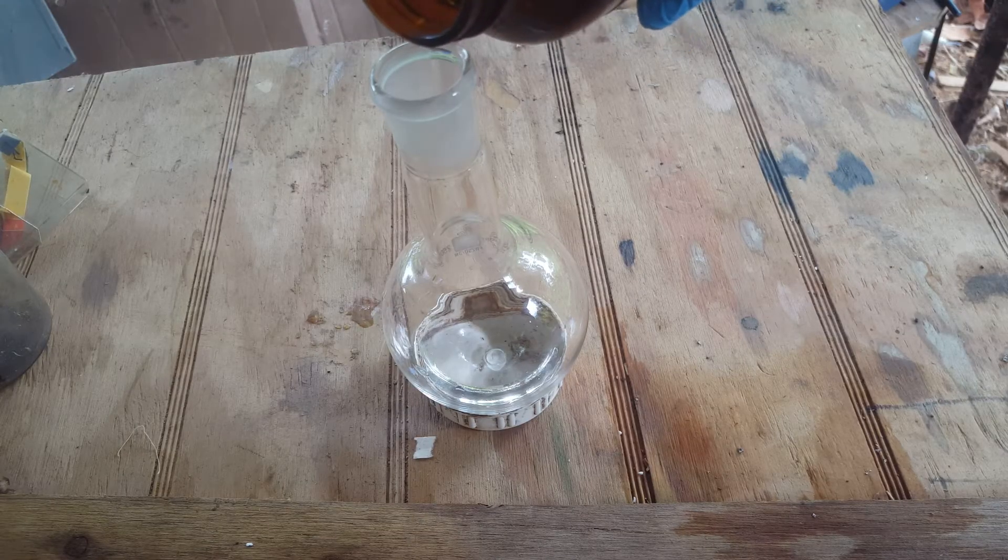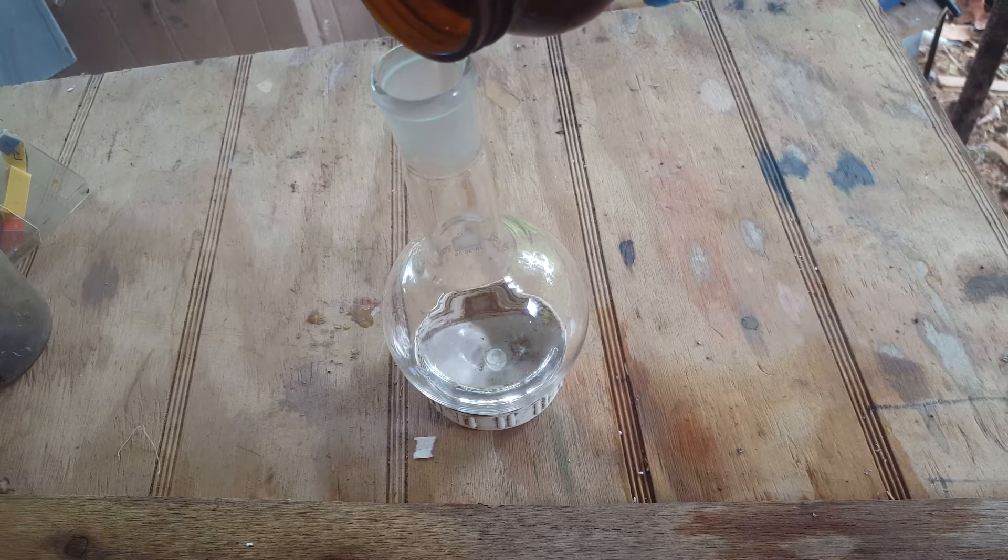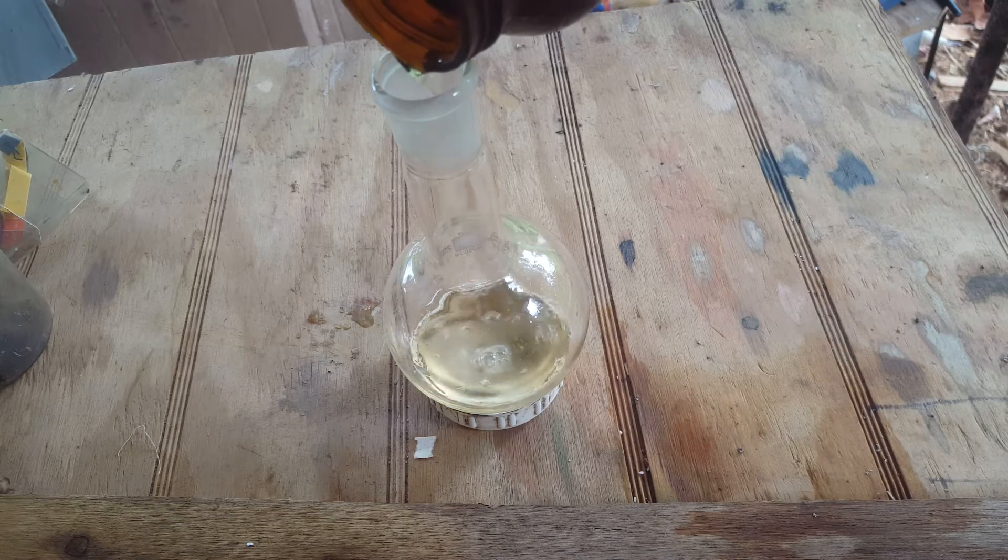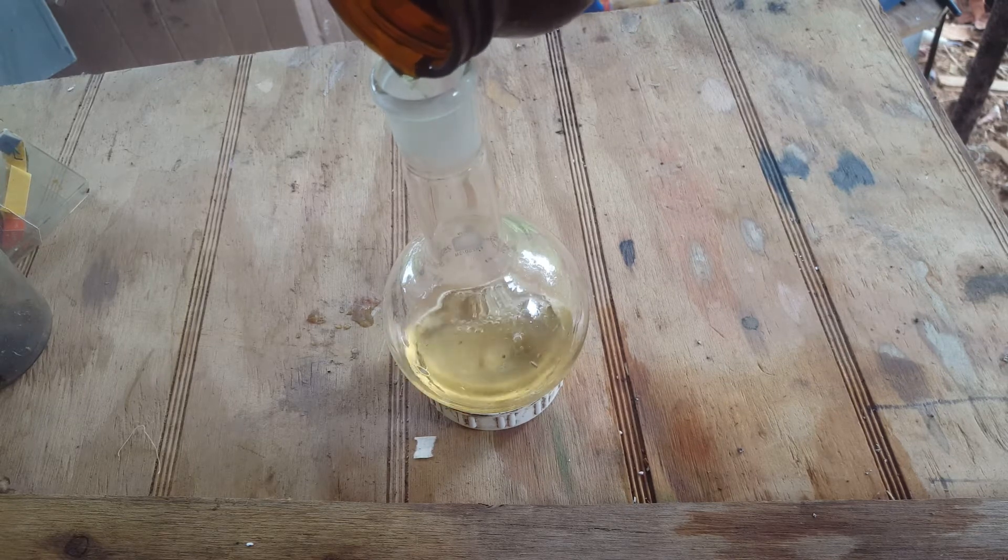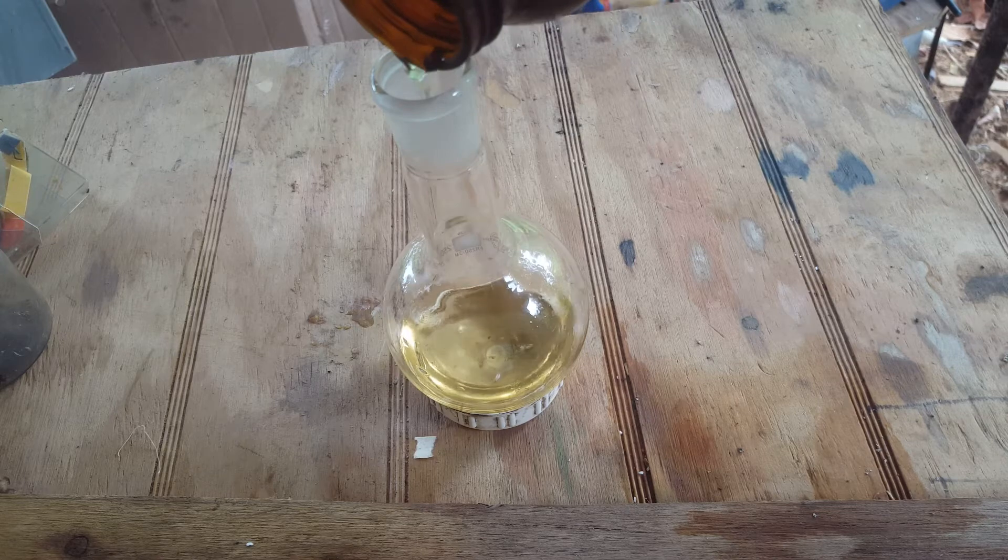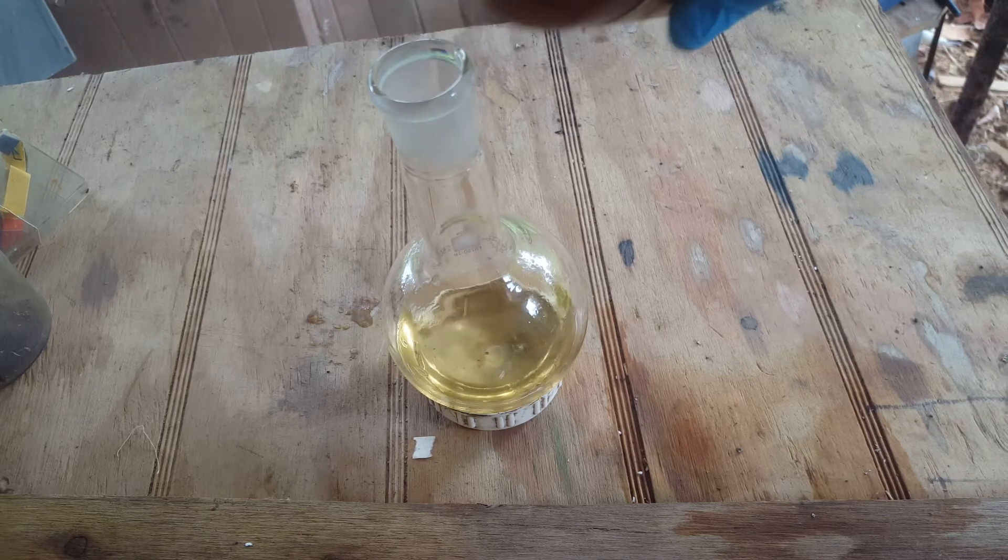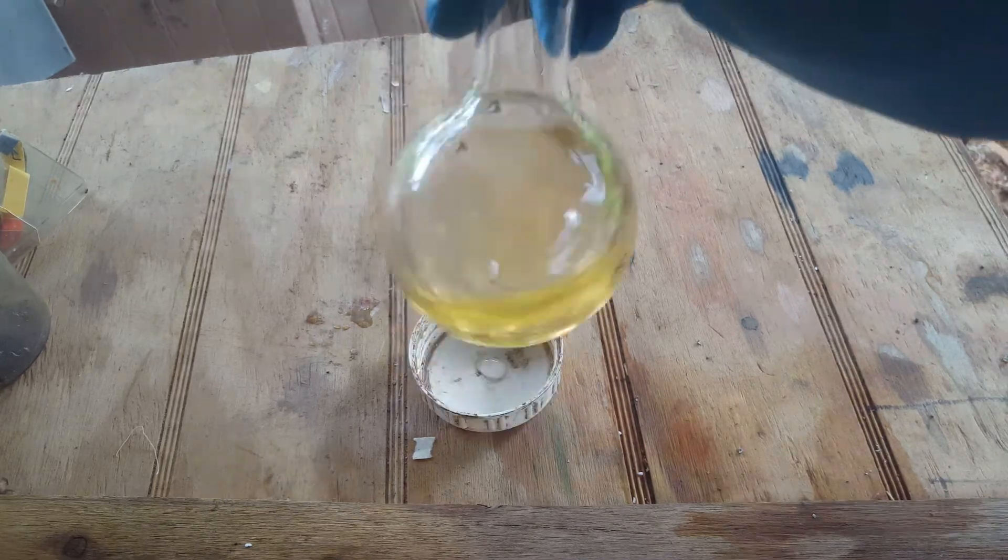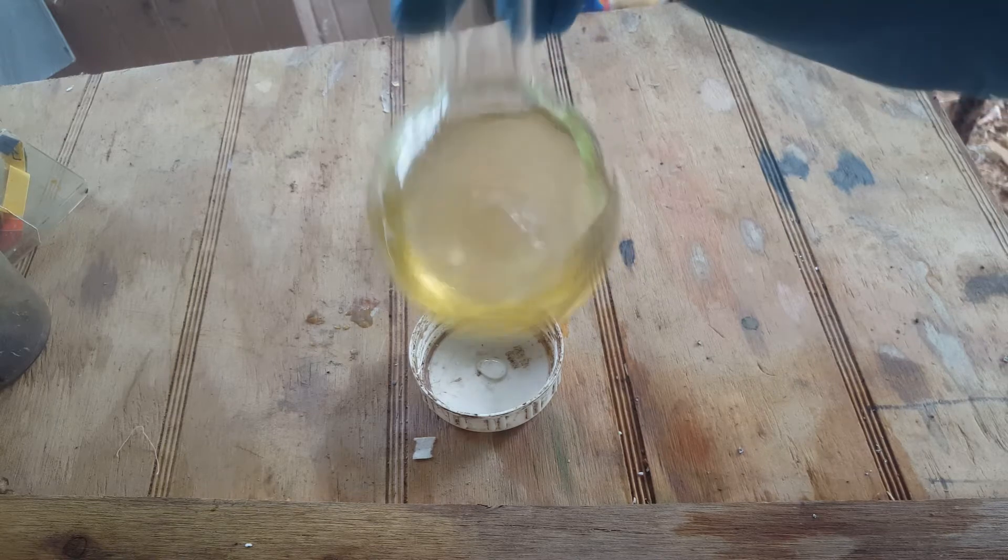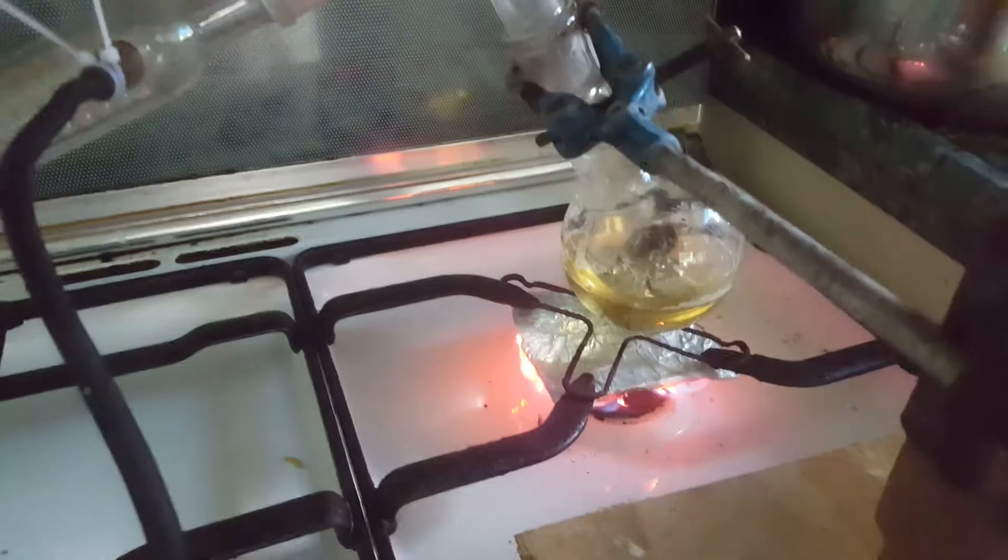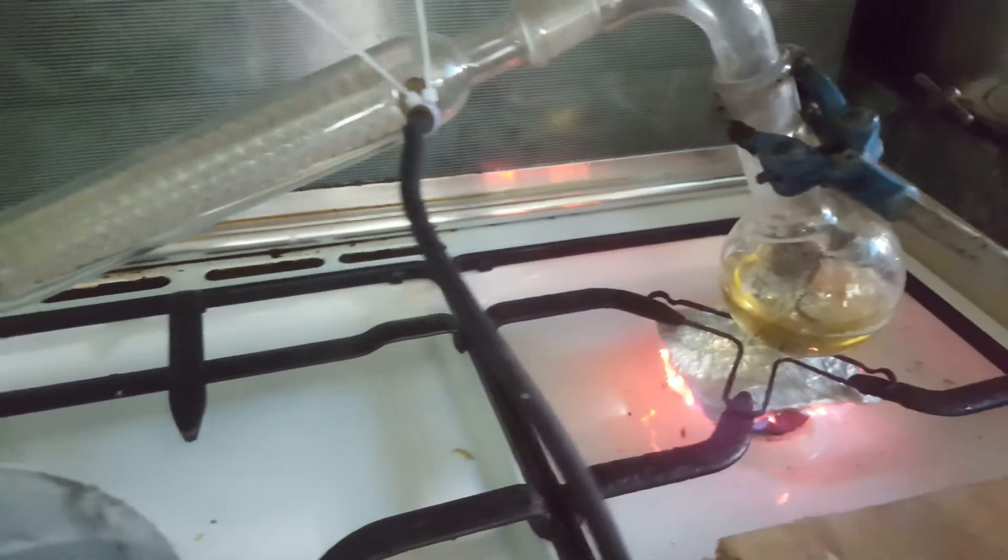Next, set up for a distillation. Distill the mixture until almost dry but not completely.